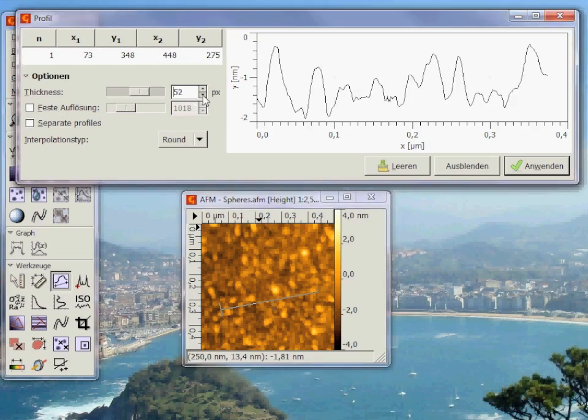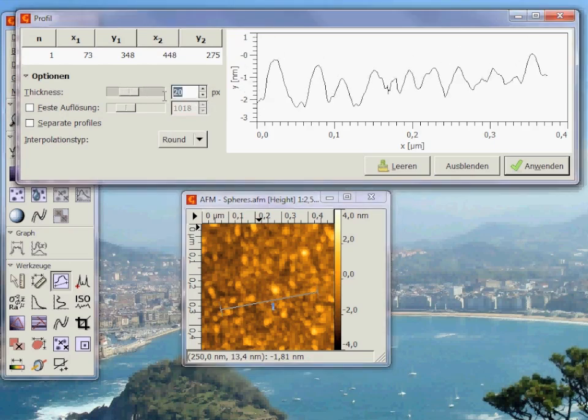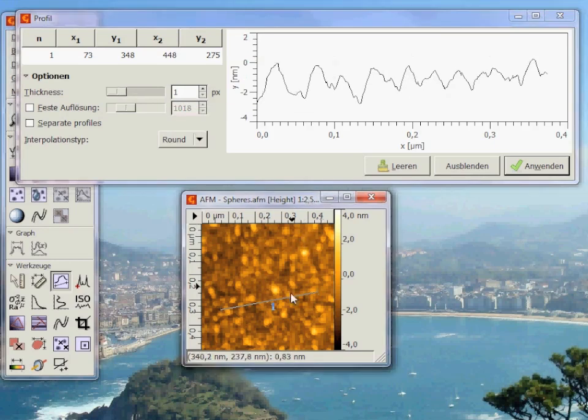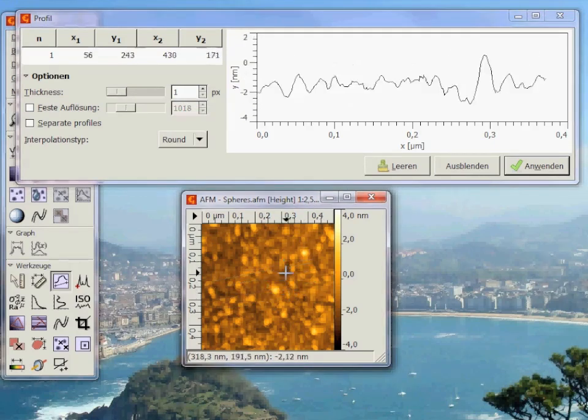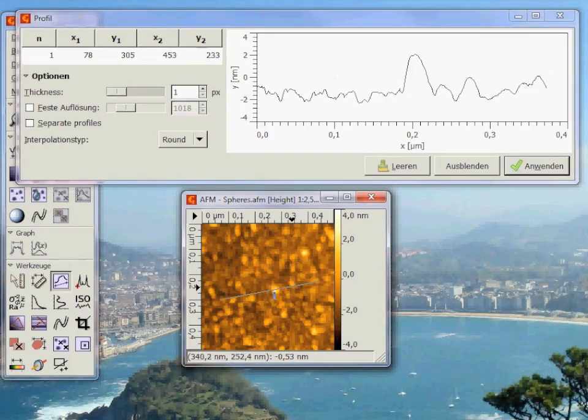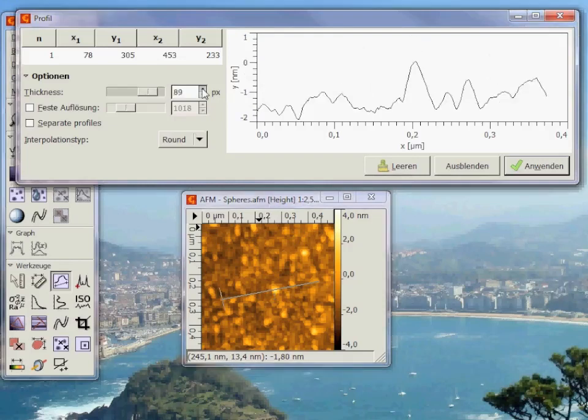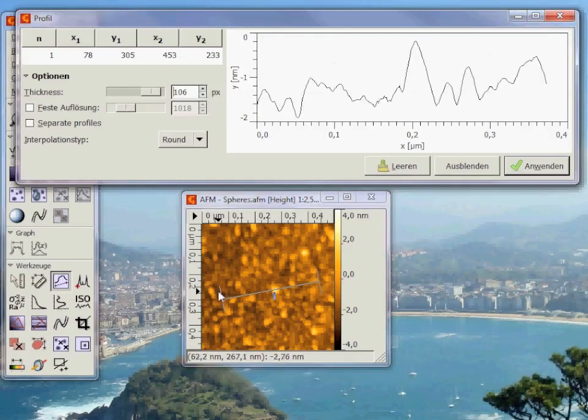Or you could just select one line. Here you see the thickness of the line.